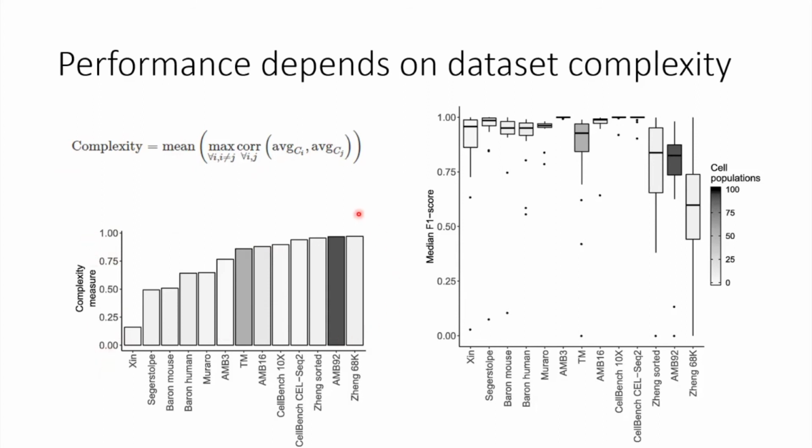What you see here is that the data sets that are very complex, the most complex one, this is PBMC data. Only 11 populations, but it is very complex. And indeed, if you look at the UMAP of the data, differentiating things that are supposed to be easy, like CD8s and CD4, is a bit difficult, especially the naive CD8 and naive CD4 are fully overlapping in the transcriptome. So if you only rely on the transcriptome, this is a difficult problem to solve.